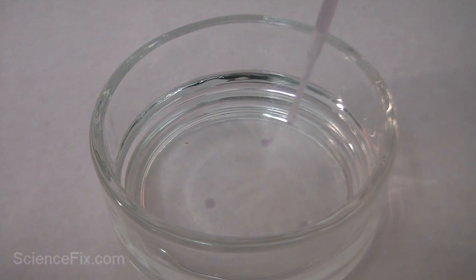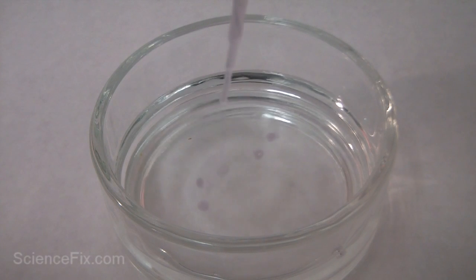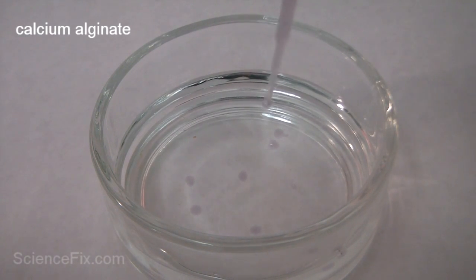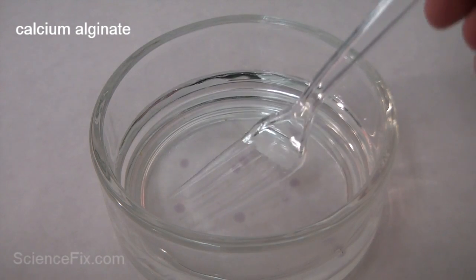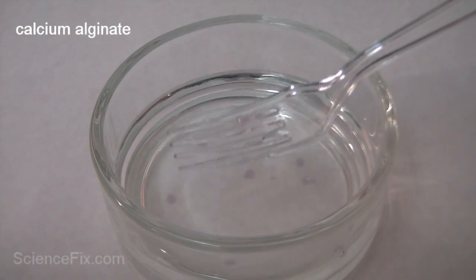Calcium ions from the calcium chloride replace the sodium ions in the sodium alginate to form calcium alginate. It's a solid gel that traps in the purple cabbage juice, so that's why you see spheres of the purple.